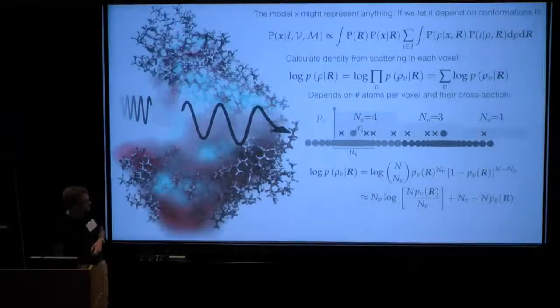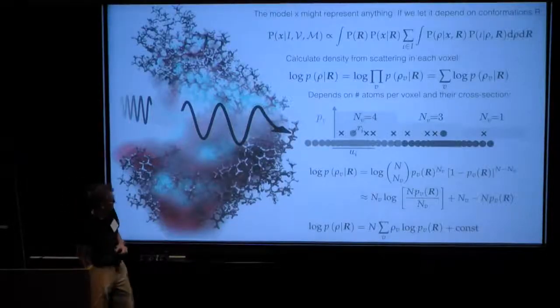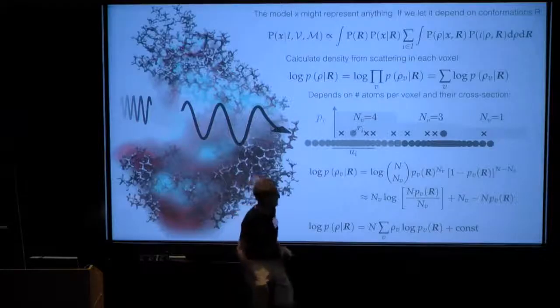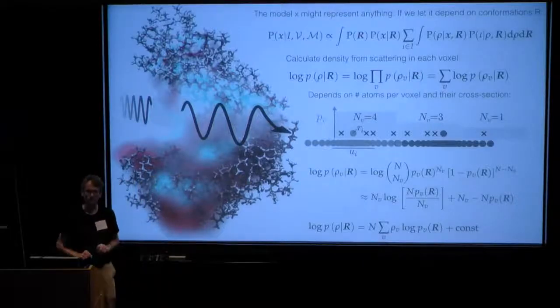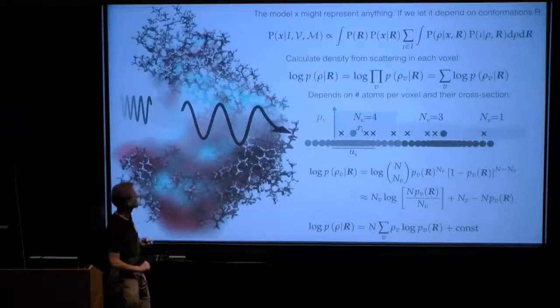And for the typical numbers we have here, where the probability of scattering is quite low and we have lots of molecules, we can use the Stirling formula and everything to simplify this a bit. And this is the last equation. This means that we can actually get a reasonably good approximation for this probability of scattering. That's pretty much a sum of something that's basically a Kullback-Leibler divergence. And that's a well-known statistical formula. We know how these behave and we can calculate them. And now you can wake up again if you didn't care about the equations.